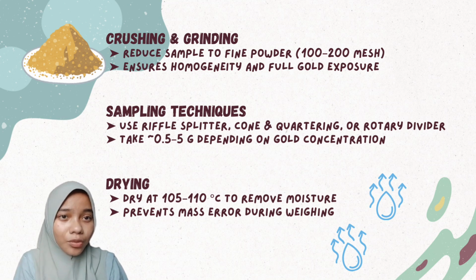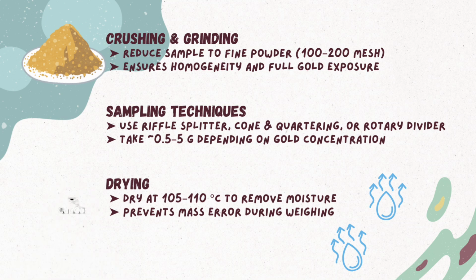This removes any moisture that could interfere with weight measurements during the gravimetric process. Accurate weighing is essential, especially because gold content is often calculated down to microgram levels.